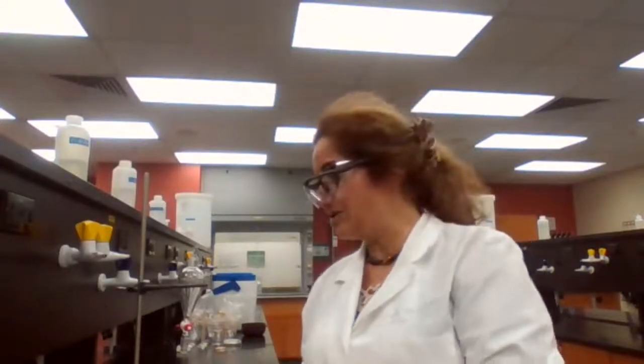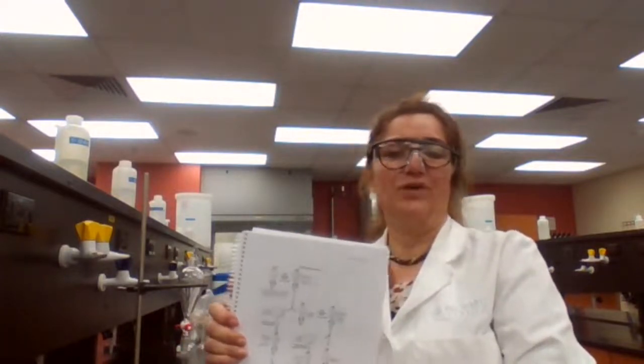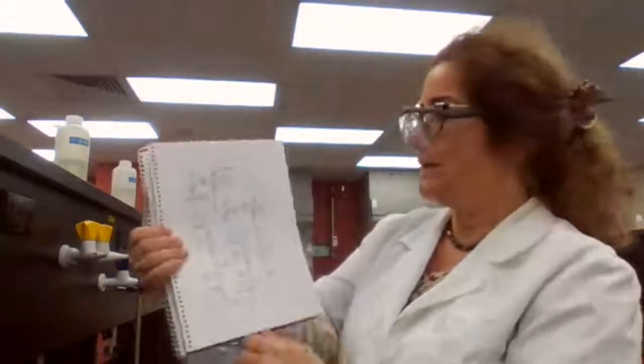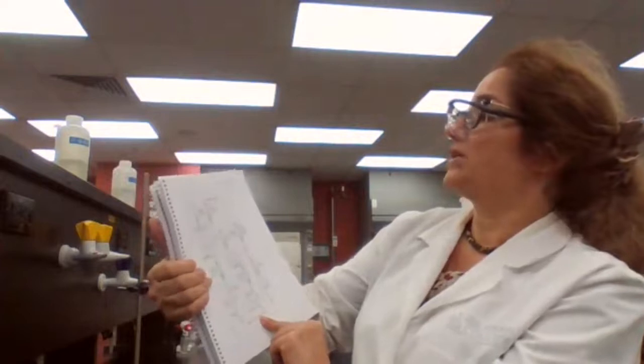So when you are doing acid-base extraction, you should have a mixture of an acid and a neutral compound, or a mixture of a base and a neutral compound, or a mixture of an acid and a base. By nature, they should have different acidity for your mixture to be purified using extraction. The diagram on page 41 shows the acid-base extraction in general.